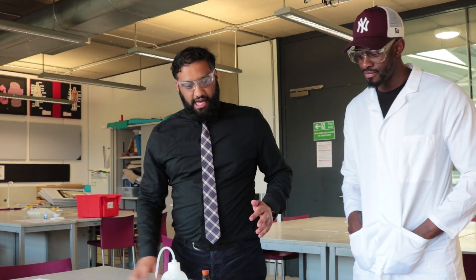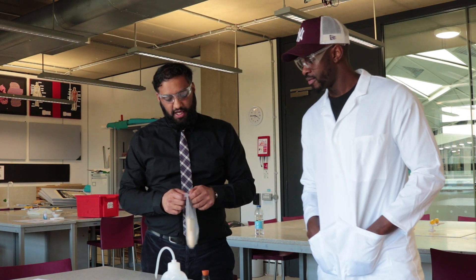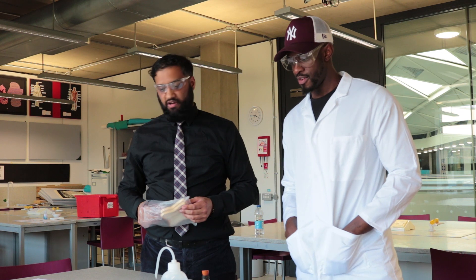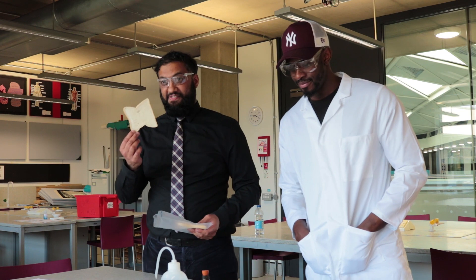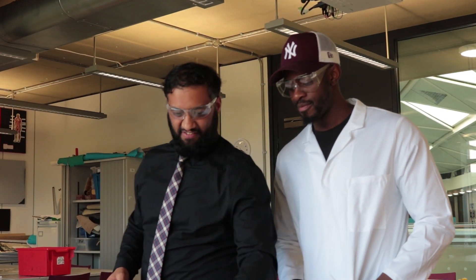We've got all our kit here, prepared it earlier on. What we're going to be doing is testing for starch, and the first thing is testing bread. What do you think we need in order to test for starch? We definitely need iodine. What colour is iodine normally? Brown.